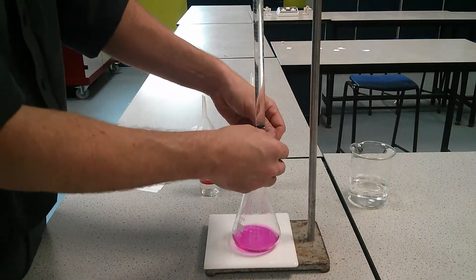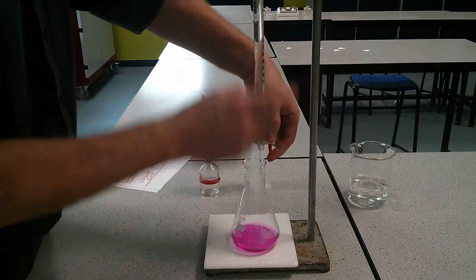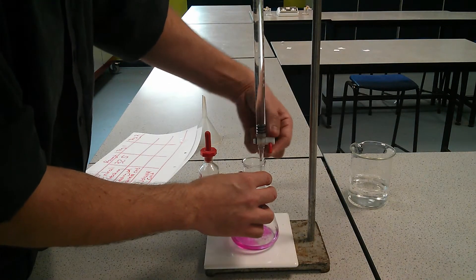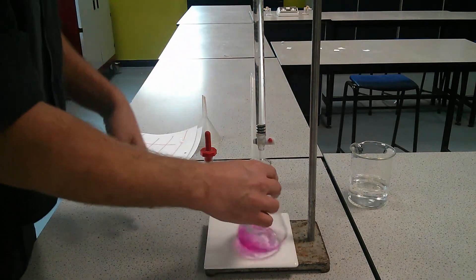So what we can do is go relatively quickly to start off with. I can open this quickly. And what I'm going to do is — not looking down at the tap — I'm looking at the volume. And I'm going to stop it when it gets to 24, just not too near.